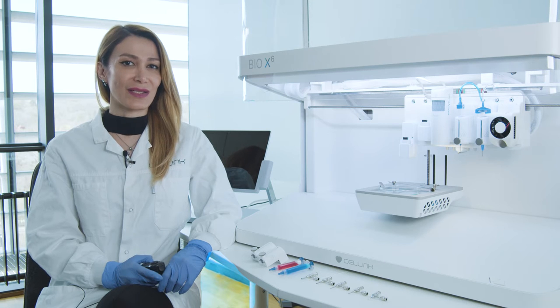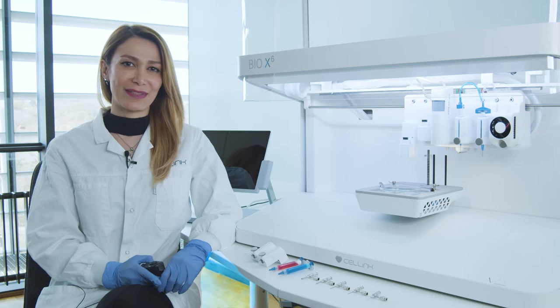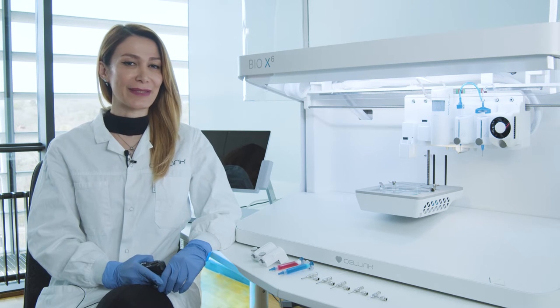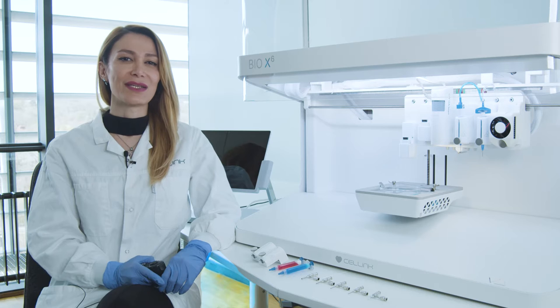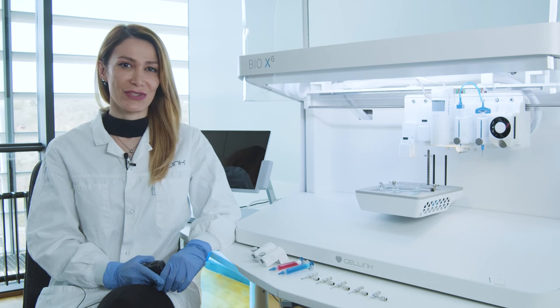Nowadays bioprinting is a rapidly developing technology for the precise design and fabrication of various complex tissues and organs. Coaxial extrusion bioprinting has demonstrated a strong potential to enhance bioprinting versatility. Coaxial bioprinting simultaneously deposits two or multiple bioinks into one another in a single filament in a concentric structure.